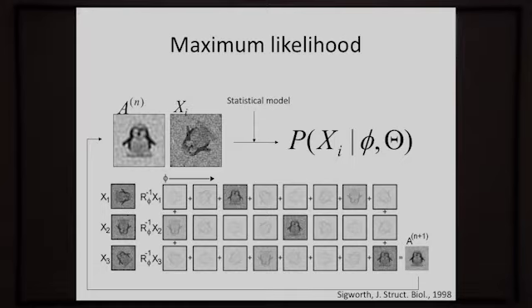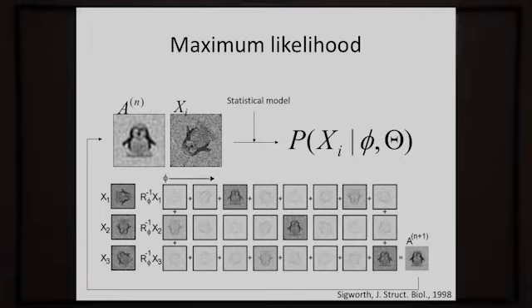And I'm going to calculate the average for the next iteration now, for example, as 75% of this and 24% of this, and then the other 1% is spread over all the other orientations. So rather than saying this is the right orientation, I'm going to calculate the new average as a weighted assignment over all possible orientations. And that I will do not only for the first image, but for all the thousands of images that I have in my data set. And that will give an image which is hopefully better than the one we start off with, very much in the same way as the cross-correlation approach, and such that we can repeat this, hopefully until convergence.